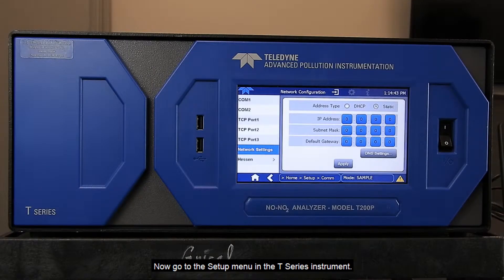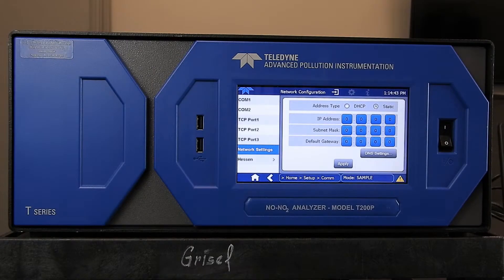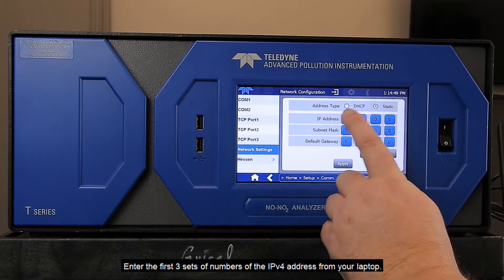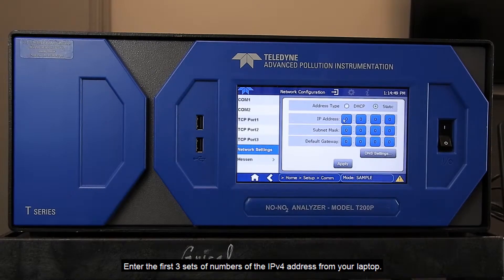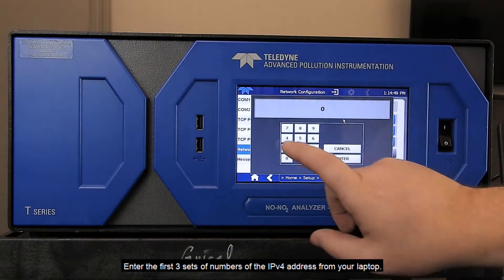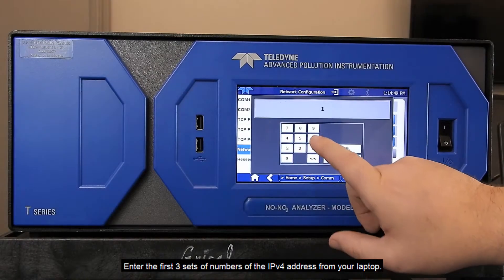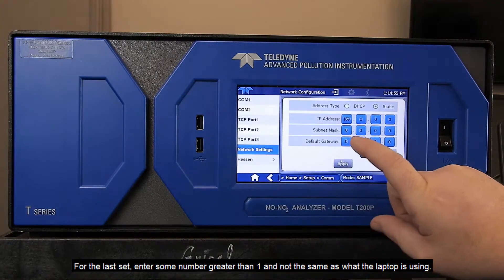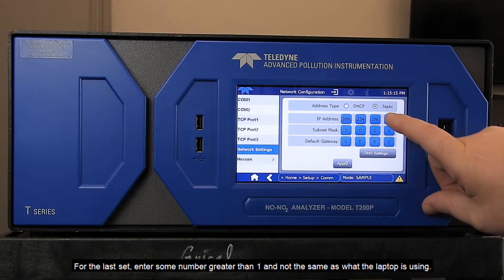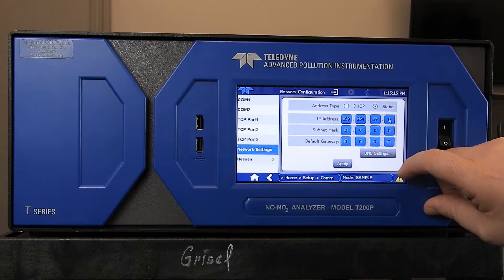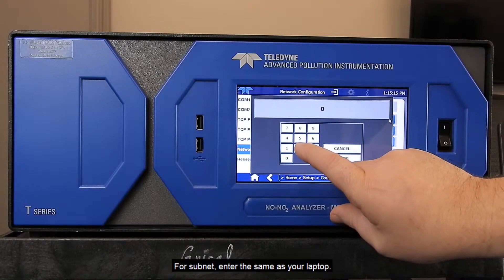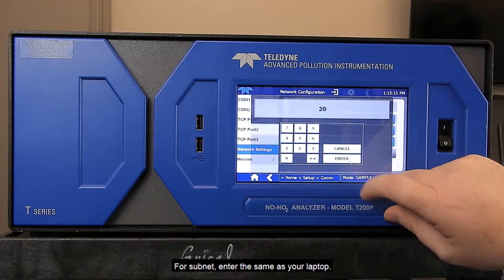Next, go to the setup menu on the T-Series instrument. Select Comms and then Static IP. Enter the first three sets of numbers of the IPv4 address from your laptop. For the last set, enter some number greater than one and not the same as what the laptop is using. In this example, we will use 20. For subnet, enter the same as your laptop.